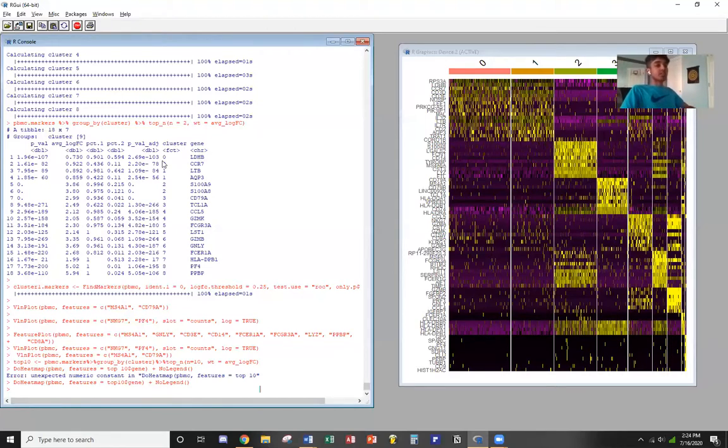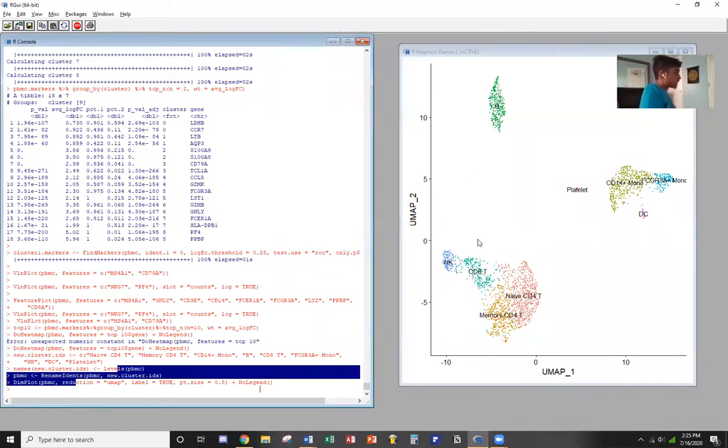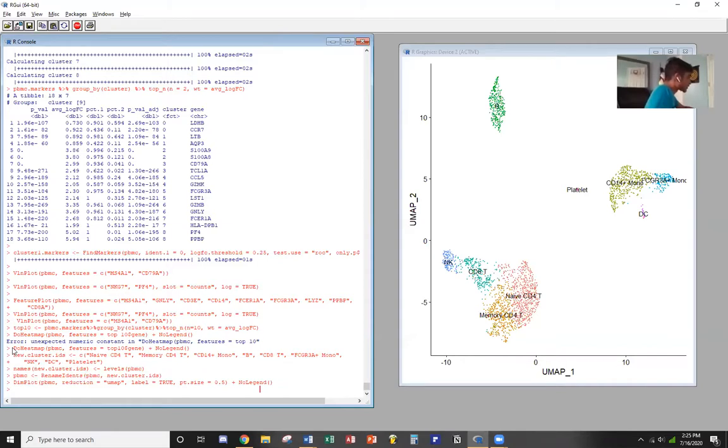And so now we're down to our final bundle of code. So finally, we will be assigning cell type identities to clusters. Sorry, getting a little bit tongue-tied here. So I'm going to pause it, write down the code, and show you guys what I did. Yep, and as you can see, I did these lines of code. It helped me basically create a UMAP here. And so this is basically how you would assign cell types to the clusters.